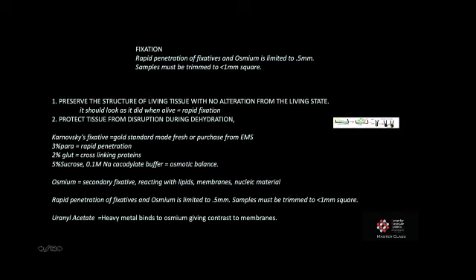Karnovsky's is made up of 3% paraformaldehyde, which is a small molecule that penetrates quickly and starts the fixation process. 2% glutaraldehyde is a larger molecule, but provides the cross-linking between proteins that will create a permanent fixation of the cells. We have 5% sucrose and 0.1 molar sodium cacodylate buffer for osmotic balance within the cell. We don't want to have our cells shrinking or swelling as a result of our fixation. So we fix our cells for an hour at room temperature.